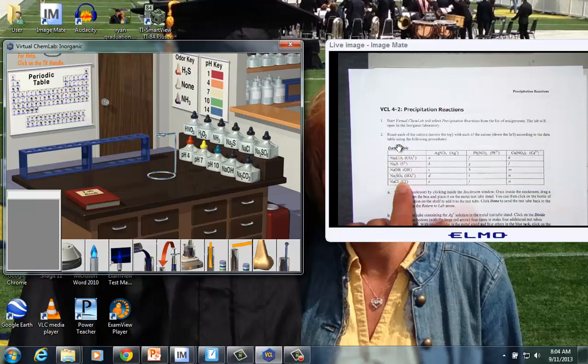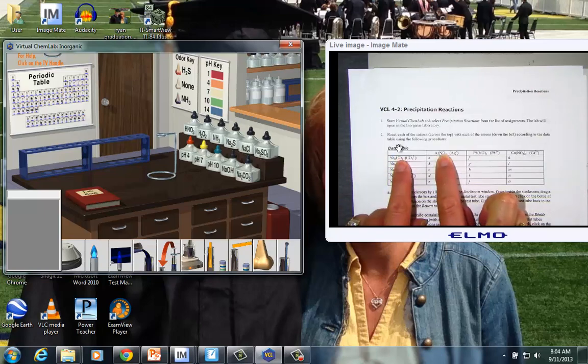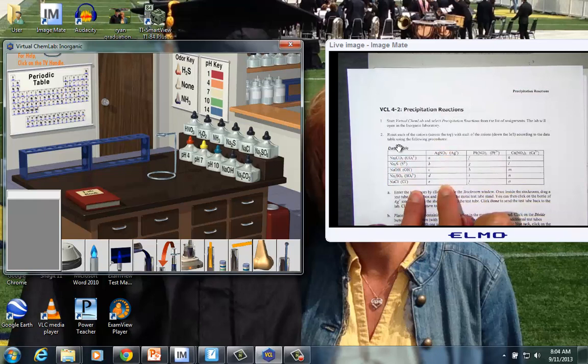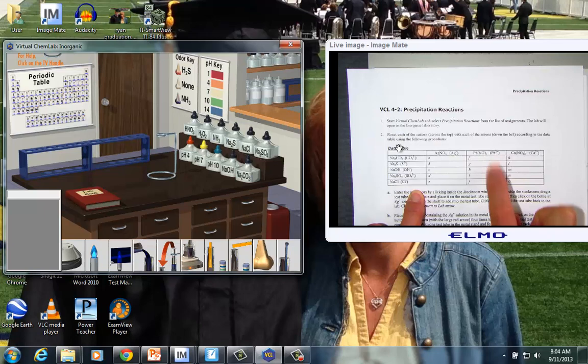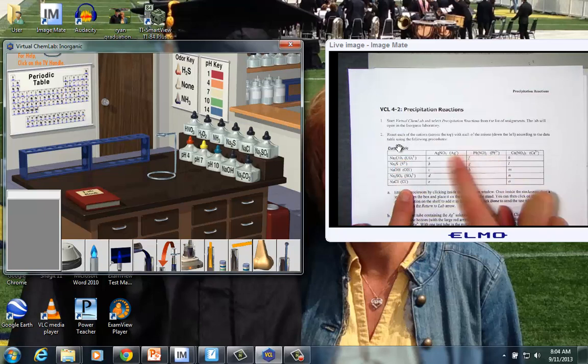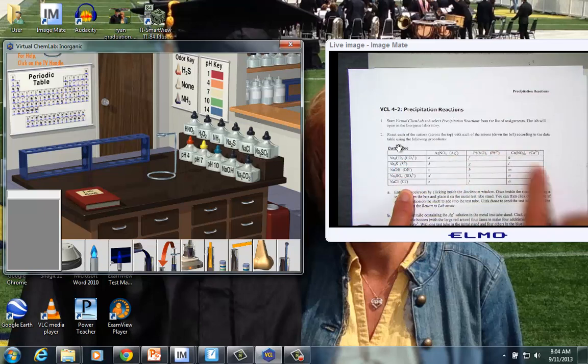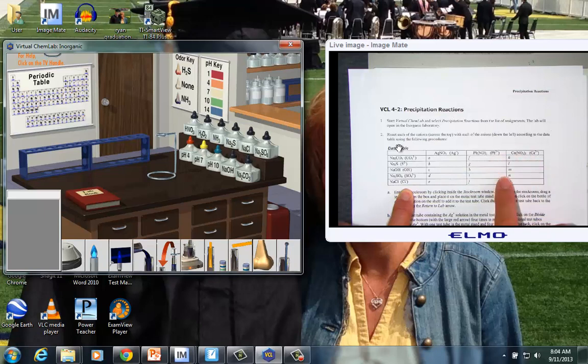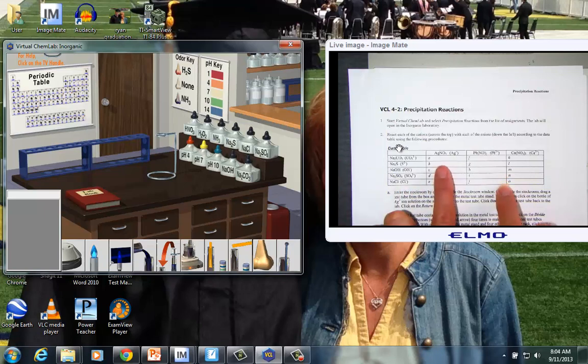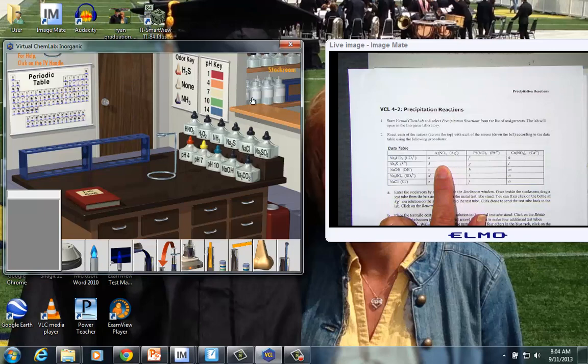So we'd like to react silver nitrate with sodium carbonate, silver nitrate with sodium sulfide, and so forth. We move to the next cation. So we react each of these negative ions with each of the positives, and all we're being asked to do here is record observations. If a precipitate forms, we should see evidence of a chemical change. So let's model how to go about getting started.